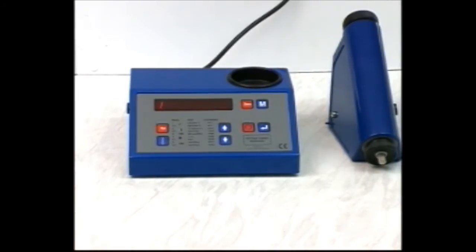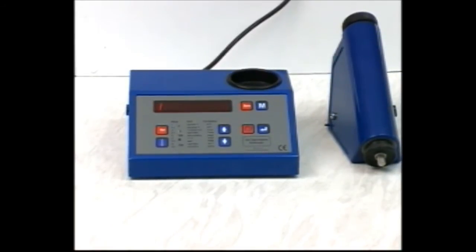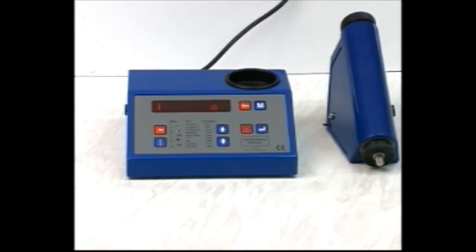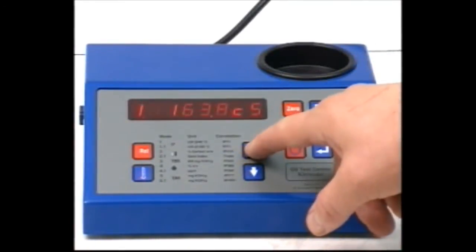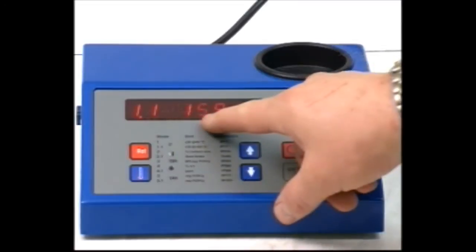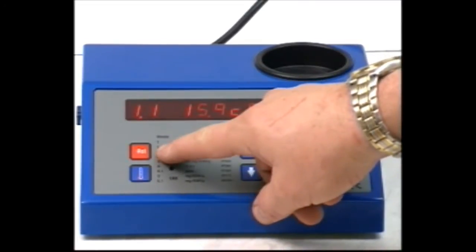The display will now give an average of the two readings in Centistokes at 40 degrees Celsius. If you need to calculate viscosity at 100 degrees Celsius, press the up arrow key at this stage to select Mode 1.1.